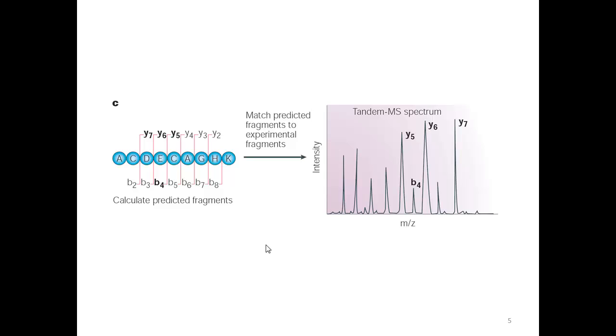So, this is going to show what data will start to look like. We have this peptide with a number of amino acids. We're going to fragment it at as many places as we can. These small fragments like the B2 ion and the Y2 ion will be only two amino acids, so they'll be pretty small. Maybe this is B2, maybe this is Y2. And then we're going to have larger and larger fragments. Here's a Y7 ion. This is right here. This would be one of the largest peaks that would be observed. But by fragmenting it all, we're going to generate lots of different fragments, both the B and Y ion series, and then we're going to use this pattern to calculate its identity.